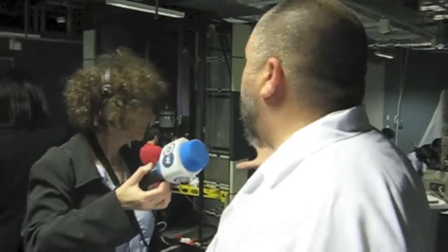As we move smaller in dimension and we get down to a limited number of atoms, the property of the atoms change, and the property of the overall system will change. And we can come in here and investigate those properties at the atomic level. Now, we've got 6 microscopes in this room in total, and they each have a little bit different function. Sometimes I like to talk about what those are because you guys not being in this field probably think it's all science fiction, and I can't really do that with these tools.